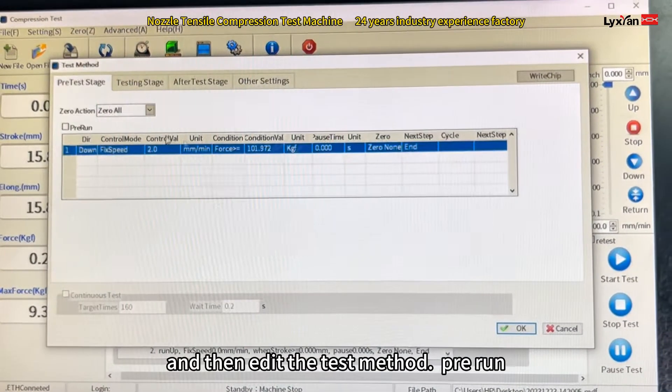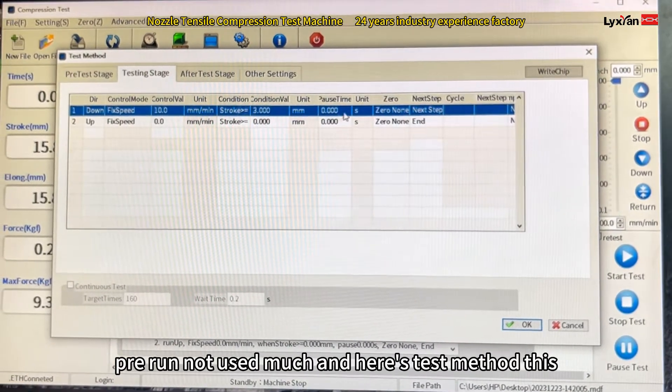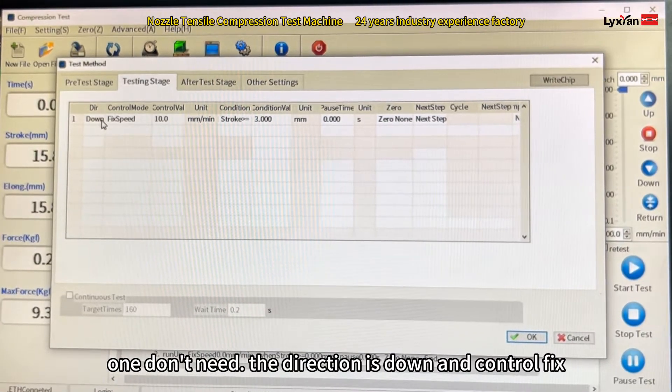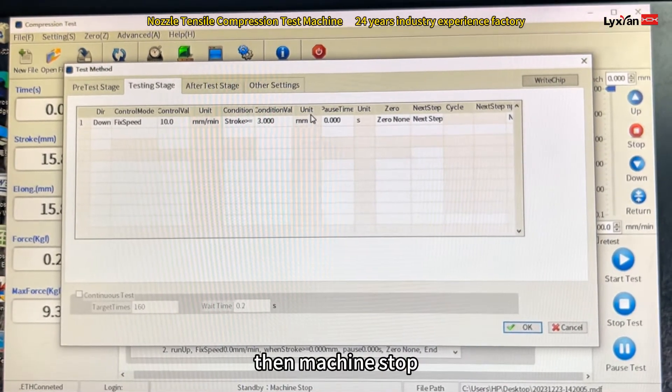Then edit the test method. The pre-run is not used too much. Here is the test method: the direction is down, the controller is fixed speed at 10mm per minute. It will run 3mm, then the machine stops.